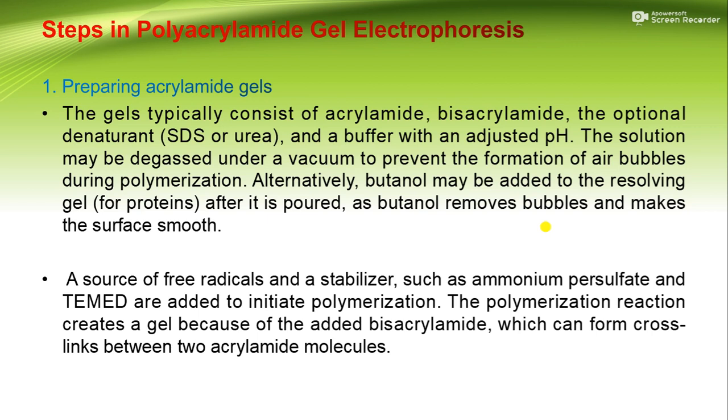A source of free radicals and a stabilizer, such as ammonium persulfate and TEMED, are added to initiate polymerization. The polymerization reaction creates a gel because of the added bisacrylamide, which can form cross-links between two acrylamide molecules.